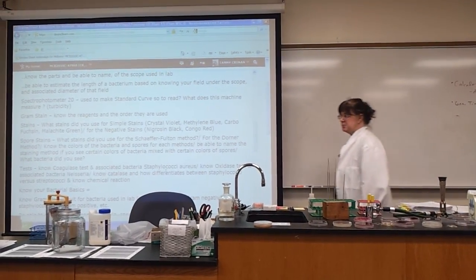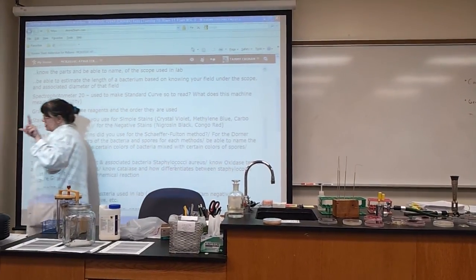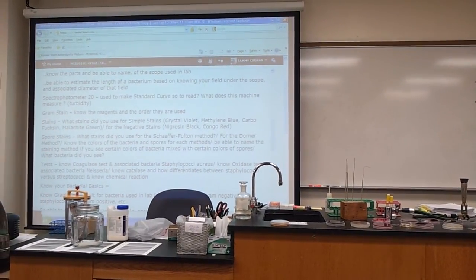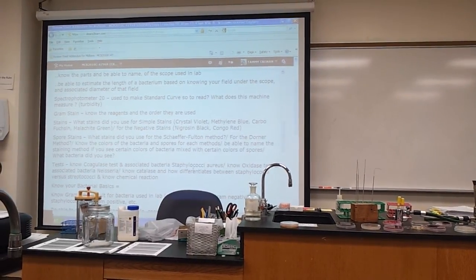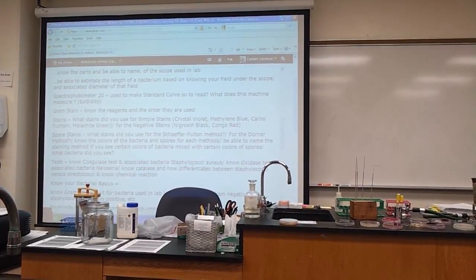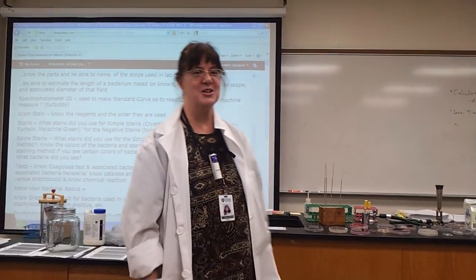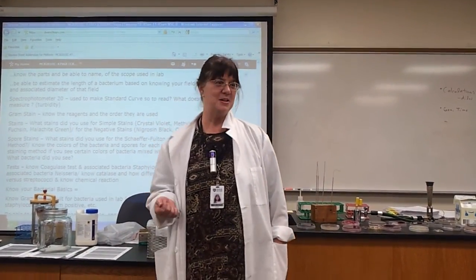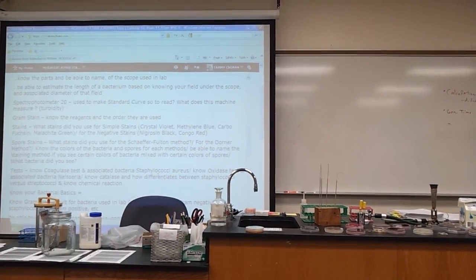And you need to be able to spell spectrophotometer 20. It measures the turbidity. How does it, what's the basis for measuring the amount of bacteria? Turbidity. Good going. Okay. Can you spell it?